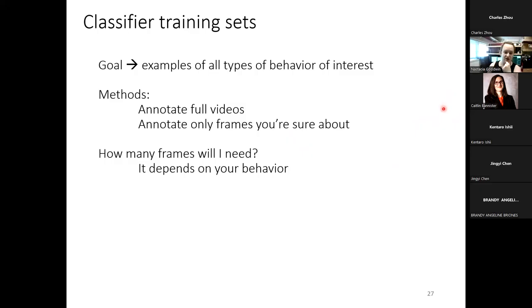I always make directional classifiers because I'm interested in the reciprocal social interactions. And so I always have this set up so that I have one aggressive mouse and one subordinate. And I'm specifically looking at aggressive behavior versus coping behavior on the part of the other mouse. But you can definitely just make classifiers where any attack in a video is counted as positive.